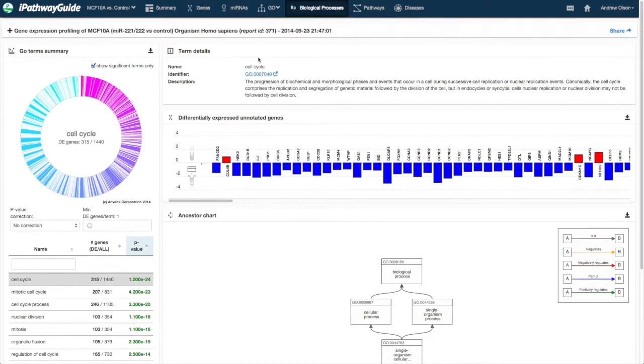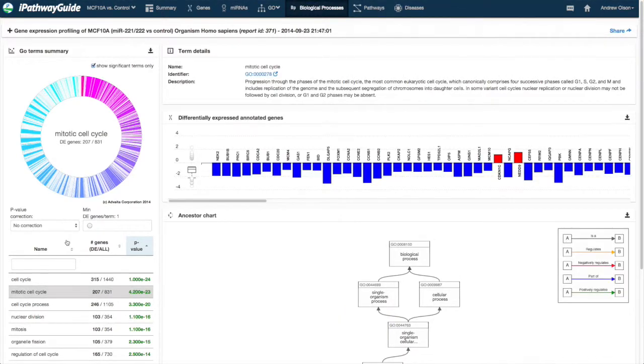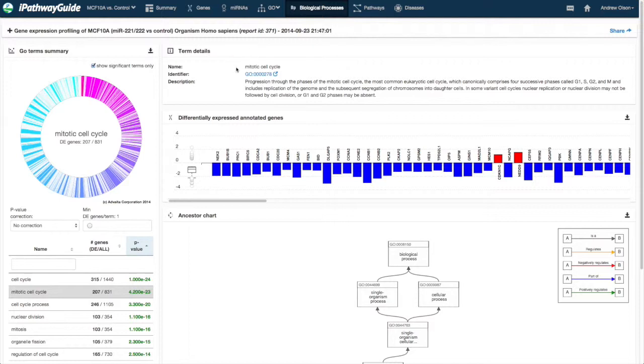There are three sections that update depending on the Gene Ontology Term or GO term that is selected. In the Term Details section, information about the selected term, its identifier, and its description is provided.